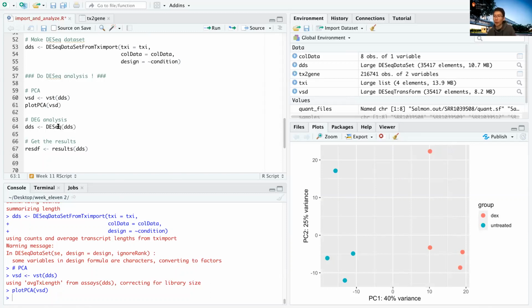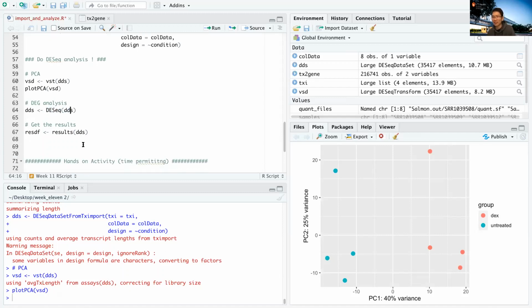Oh, Henry actually provided the gene analysis. So you have pretty much everything needed here. I thought it's part of the homework. No, I figured this part's only a couple lines, so I might as well show it.